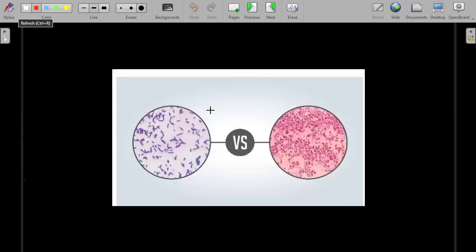Okay, so when you view under a microscope, if the bacteria is gram negative, you get a view like this. If your bacteria is gram positive, you end up retaining your crystal violet color there. You can see if you view it under a microscope, you get a color looking like this, so you know that your bacteria is a gram-positive bacteria.